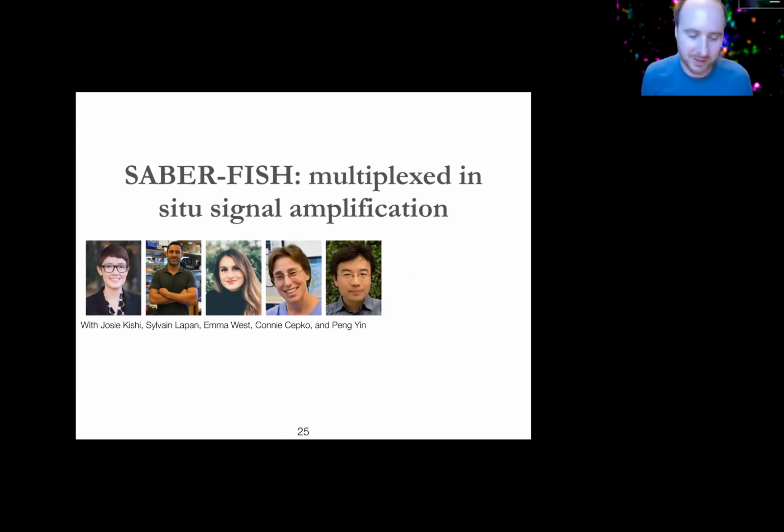But making that connection stronger, I think I'm going to now transition for the bulk of the rest of the time to talk about SABER FISH, which is one half of the SABER story. I know you've already heard about ImmunoSABER from CNM a couple weeks ago, and I'll just touch on that briefly at the end of this section.